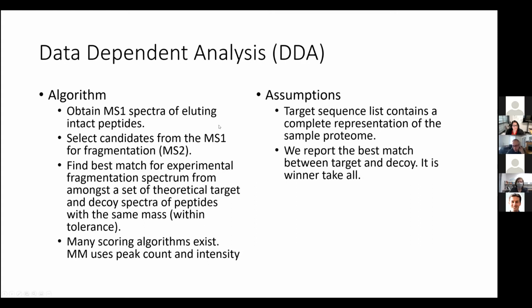There are rules for the selection. The computer can remember that you've picked a certain mass and not pick it again for a few minutes, or pick it only 3 times. That's quite common. But it's safe to say that not all things get picked, and if you were to do replicates, not all the same things would be picked in replicates.